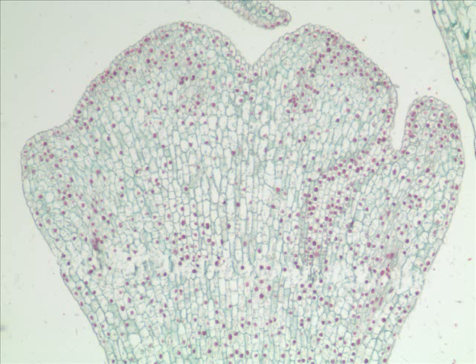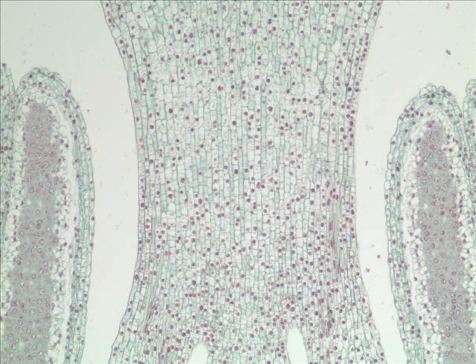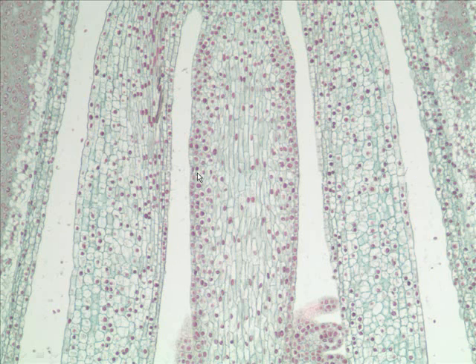We are actually in the very center, top center. And so which part is this? This would be the what? The stigma, the stigma. Below the stigma is what? The style, yes, the style. This would be the style. Below the style is the what? The ovary, yes, the ovary.